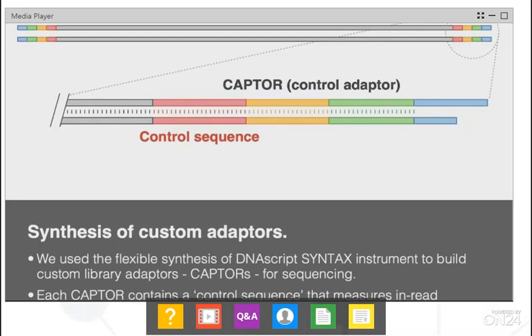And in the case of Oxford Nanopore sequencing, at least, in addition to acting as a reference standard, it can also allow us to interface with the surrounding bioinformatic architecture and dynamically control library sequencing as well.